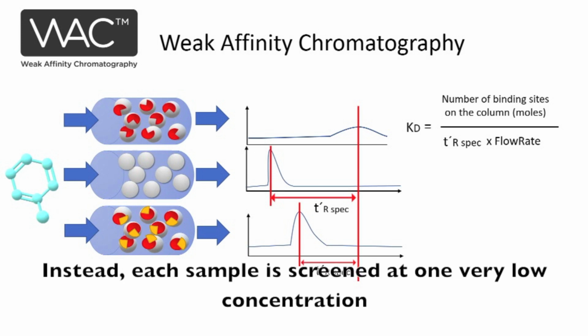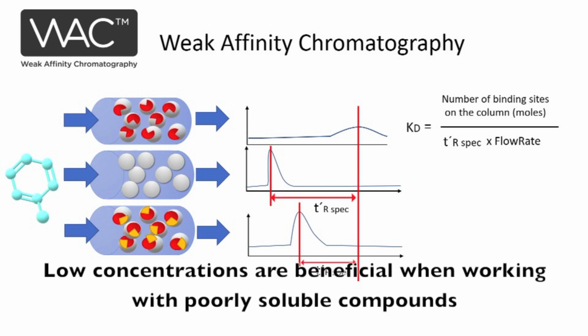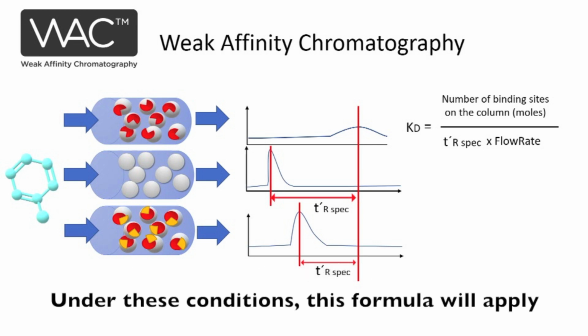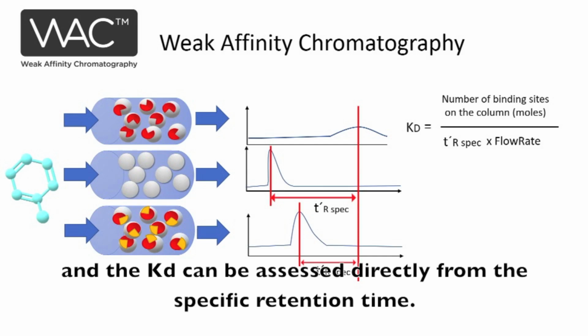Instead, each sample is screened at one very low concentration. Low concentrations are beneficial when working with poorly soluble compounds and also ensure non-competitive binding to the immobilized protein. Under these conditions, this formula will apply, and the KD can be assessed directly from the specific retention time.